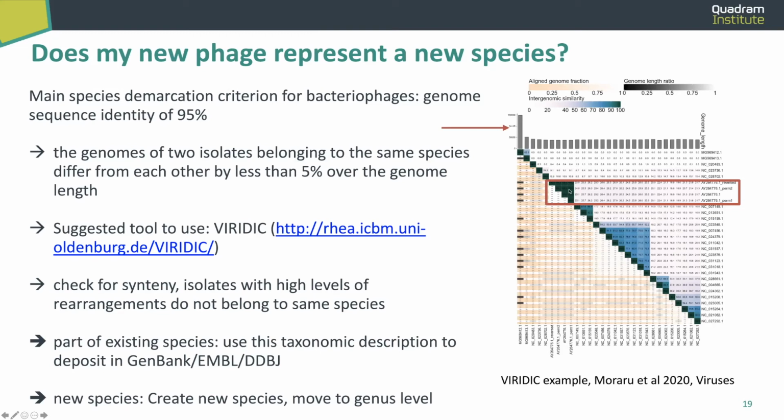But as a test set, what was added here was the same genome inverted and permuted. All of these instances show you the same number in intergenomic similarity, but there are differences in the genome rearrangement. So it's always good to look at your genomes as well.